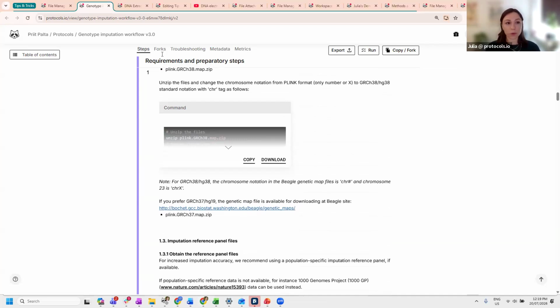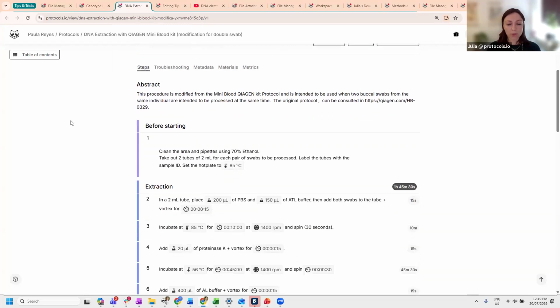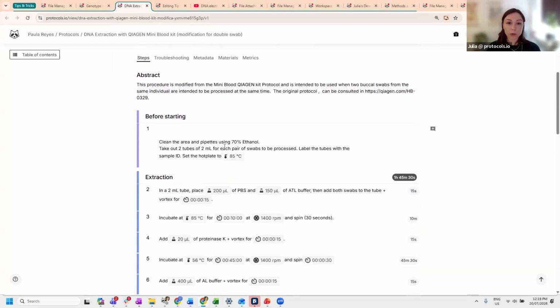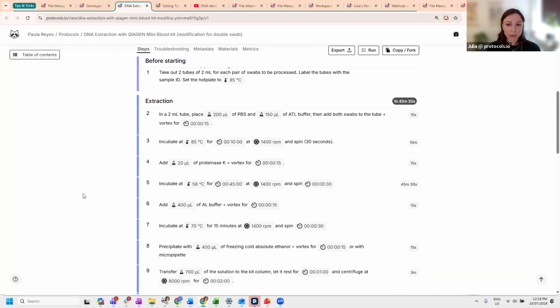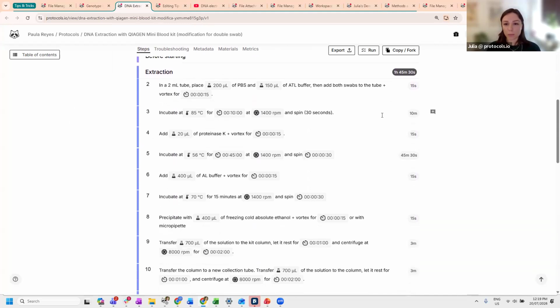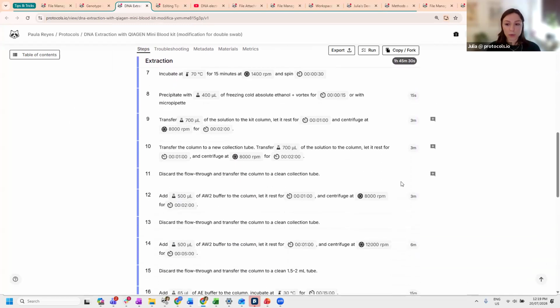If people want to refer back to it. And then the other example I've prepared here is a little bit more of a wet lab-based protocol. And so we can see as well, they've put some different components in this protocol. They're highlighting things here like temperature, amounts, time. Those are all really important variables when you're running an experiment in the lab, as you may be aware. And they've added in the timings for each of those steps too.